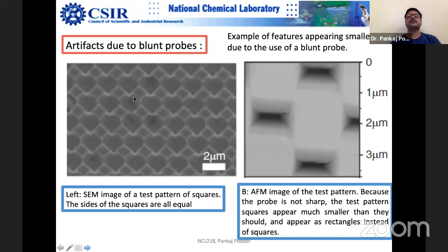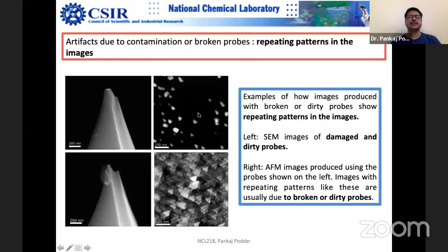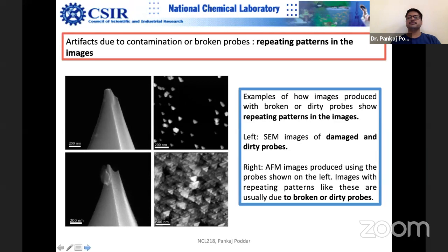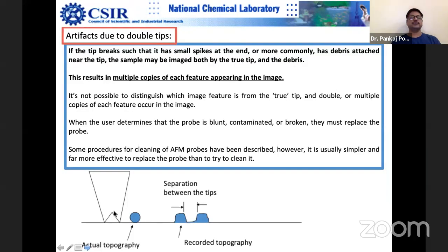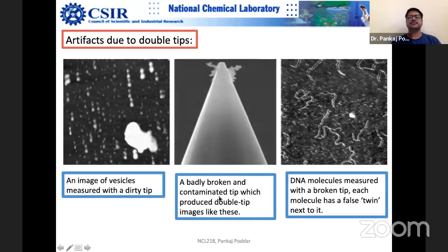Artifacts due to contamination or a broken tip result in repeating patterns in images. You can see that patterns get repeated. If you use a broken tip, one spherical particle will appear as two distorted images separated by the distance between the two tips — you get twin images. This is because of the separation between the two tip portions. Image of vesicles measured by a dirty tip: a badly broken and contaminated tip produces all kinds of artifacts.